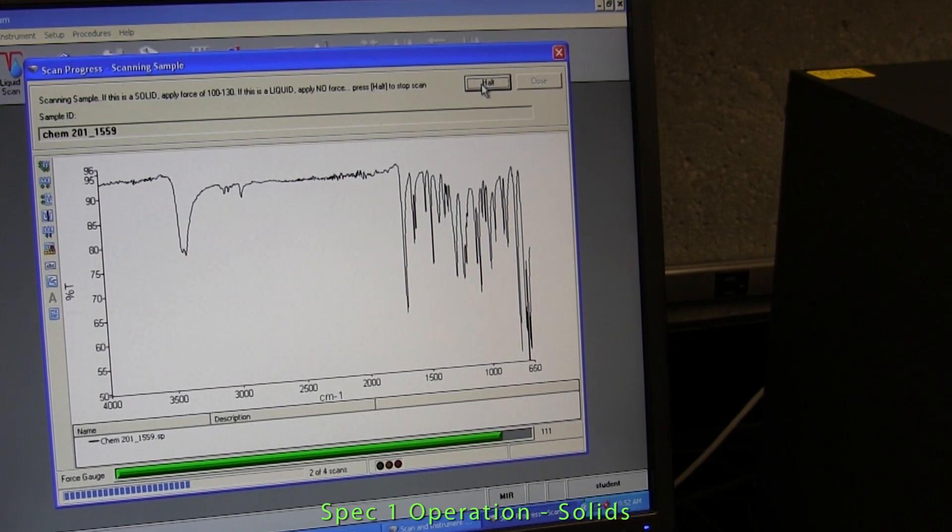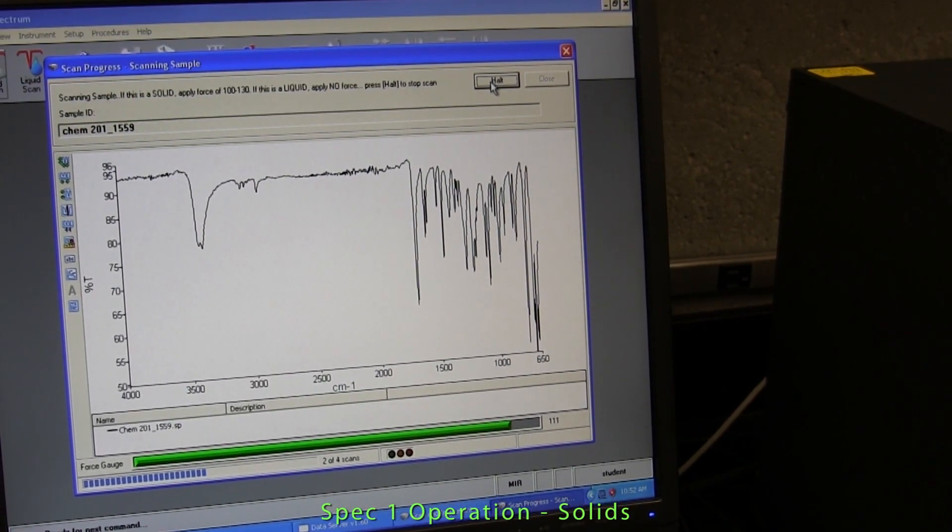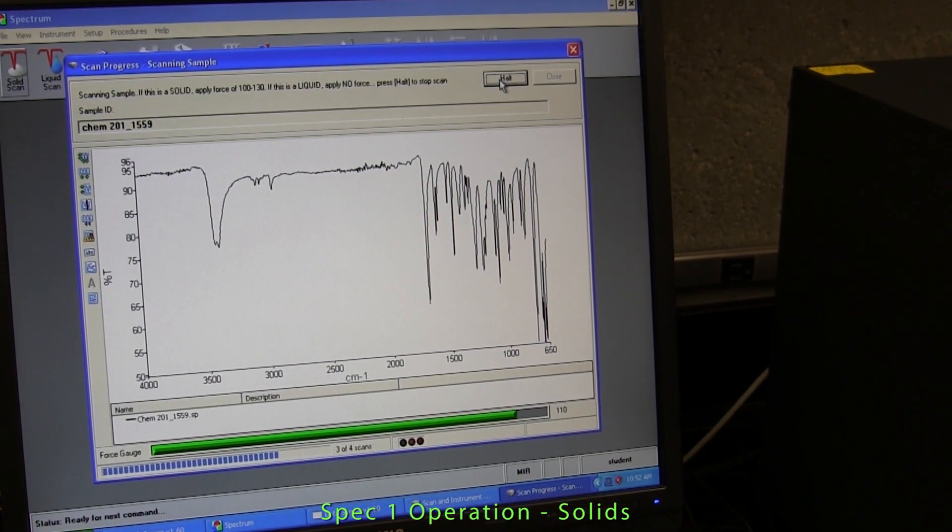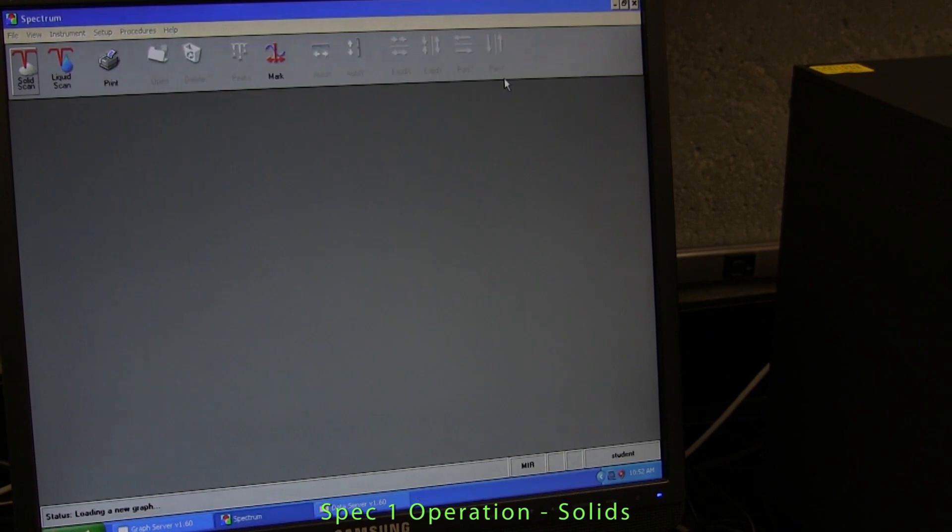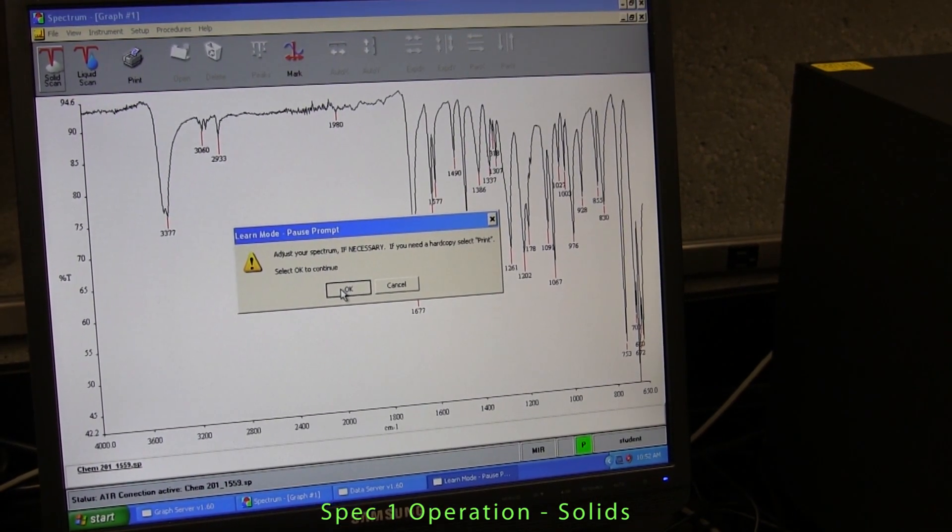In most cases, the spectrometer will scan the sample four times, which takes just a few seconds and then displays the average result of the four scans on the screen.